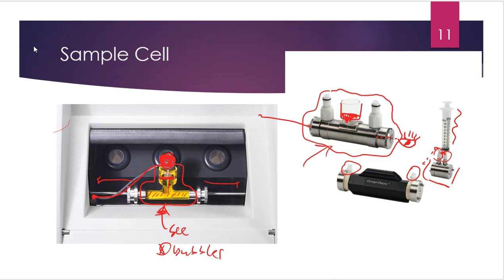And then you also see a longer tube made the same way. You see those syringe adapters on the side. You do the same thing here. Take that syringe and squirt sample into that polarimeter tube until it goes drip, drip, drip out the other end. And then you just wipe that off. And then again, you want to take your squinty little eyeballs and look through the polarimeter tube and make sure that you can see all the way through from beginning to end. And if you can, it's ready to be loaded up.